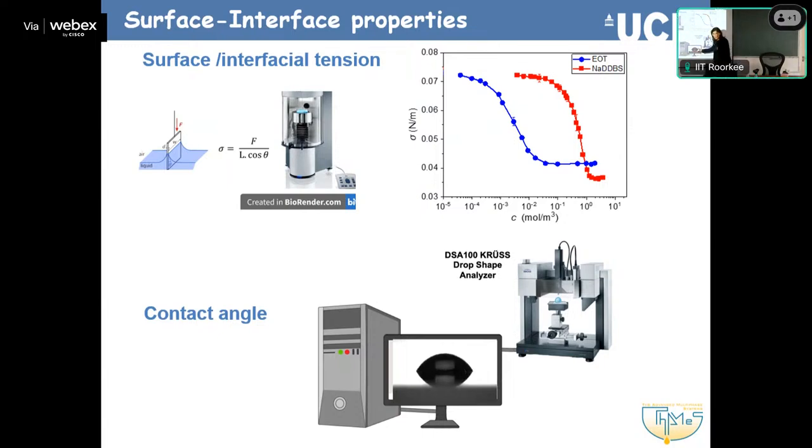You can do other things as well. I think somebody mentioned heat transfer before, because basically what you see here is evaporation as well. So you can also study more complex phenomena such as evaporation, spreading, also with these imaging techniques. What you are going to do in the afternoon is that the drop stays as it is, and you just measure the contact angle.